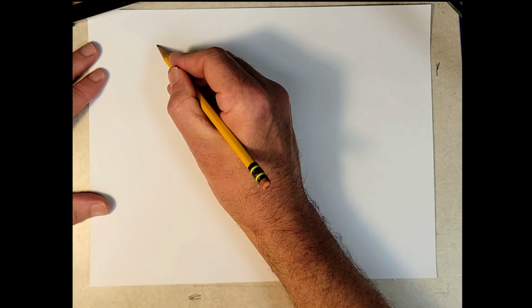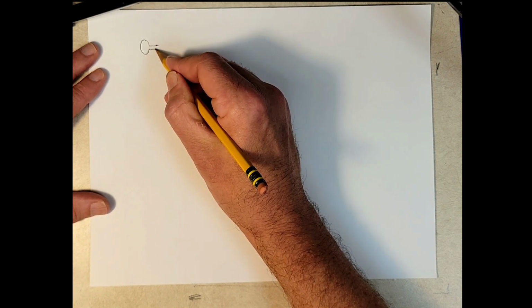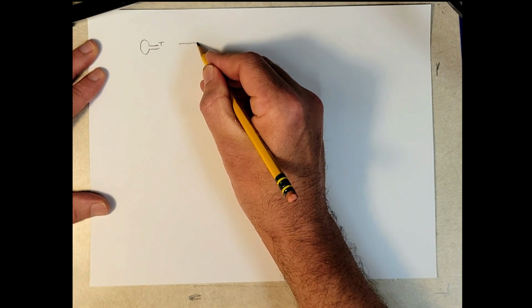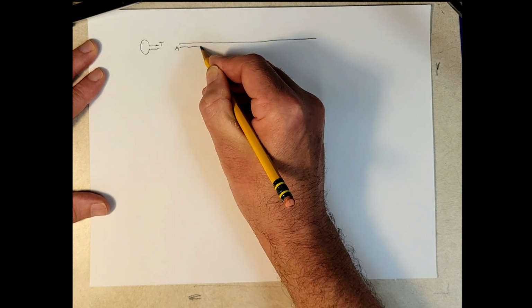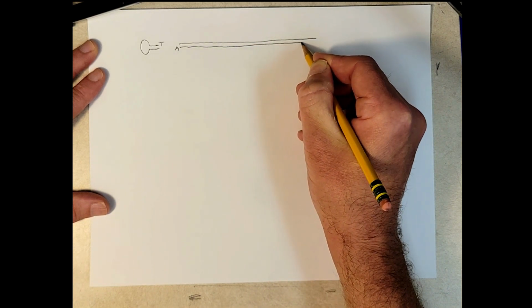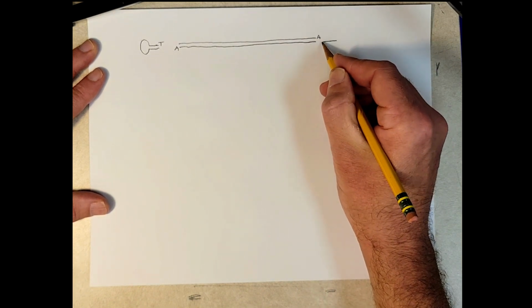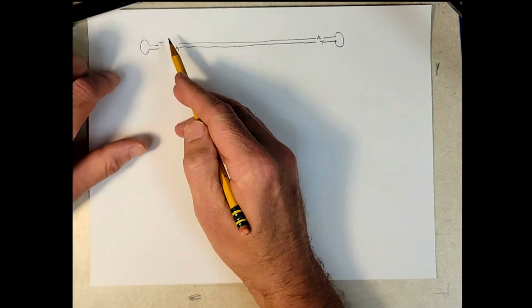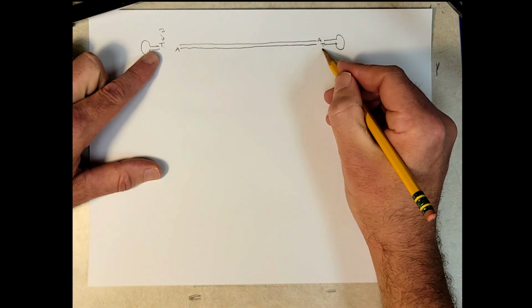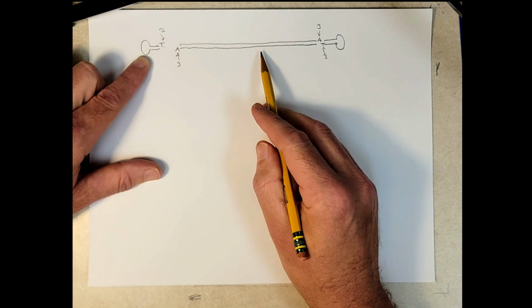So what we need to do now is mix that adapter. Here, let me diagram a couple of these. So here's an adapter with a little T overhang, and let's take one of our molecules that represents the millions we have in our solution of end-repaired and A-tailed DNA fragments. What we want is one adapter stuck to each end of this molecule. So here we have T's on the 3' ends of the adapters and A's on the 3' ends of the DNA fragments in the library.